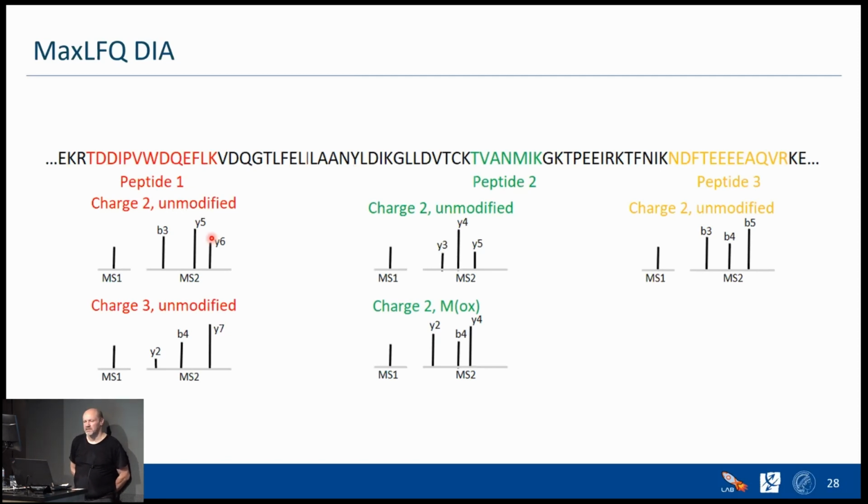I think right now this particular way is rolled up only into the protein level, but it would be doable for the peptide level as well. At the moment, for the peptide level, we only have some intensities that you can use. But that would be an easy extension, to get the MaxLFQ values reported on the peptide level or also the PTM site level. That's indeed something very useful, because you would get this multiple estimate aggregation for DIA data already on the peptide, PTM, or phosphosite level, which you don't really have in DDA data. Indeed, that would be very useful. But it's not there yet in the current version. Oh, I hope we can pack it into the post-MaxQuant summer school version.